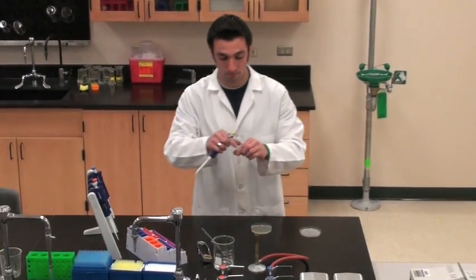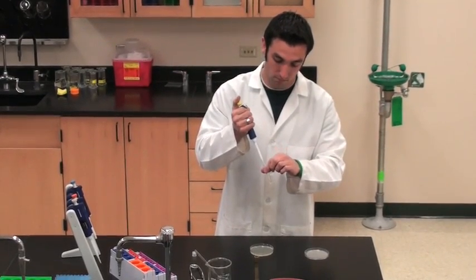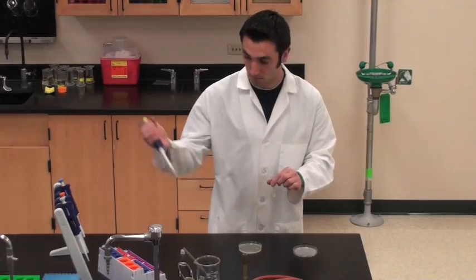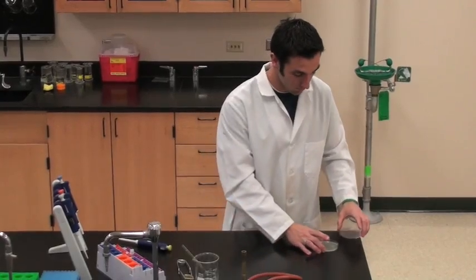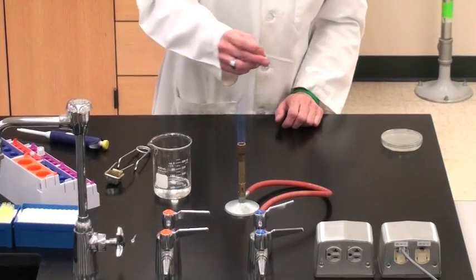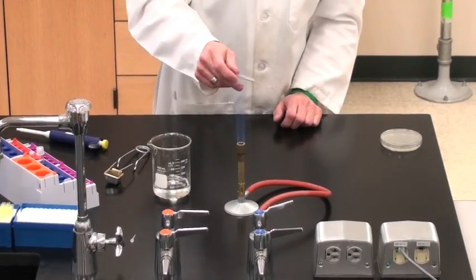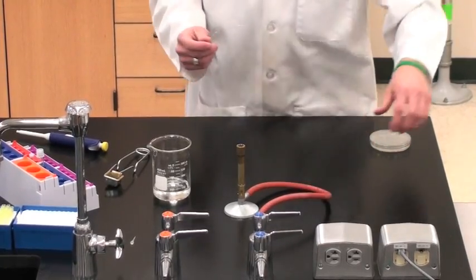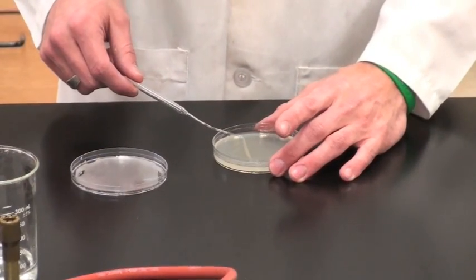Those cells that do not contain the amp selectable marker will not grow on this plate. Sterilize a glass rod with alcohol and a flame and use it to spread the culture on the plate. Make sure the rod is cool when you do this. Drag the glass rod across the agar plate, being careful not to tear the gel.